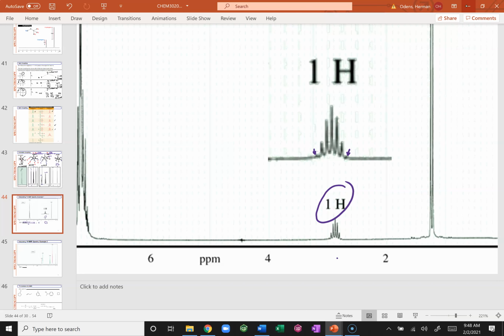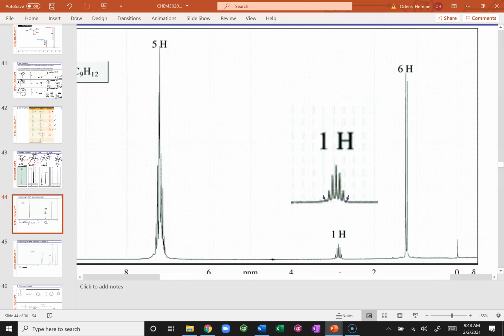I think that was an experimental NMR. It was not a standard sample because it looks kind of dirty to me. It doesn't look pristine, clean, like the other two do. So that's just my impression of it. But you can still solve it, and I'm going to help you out how to solve them. All right? So here we go.